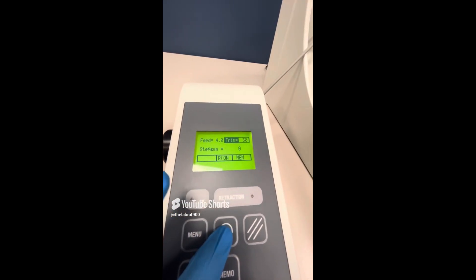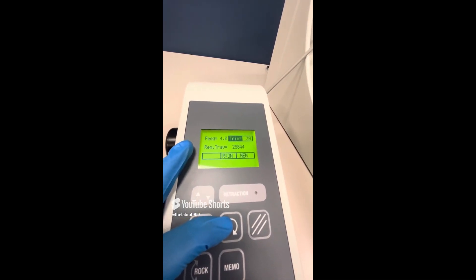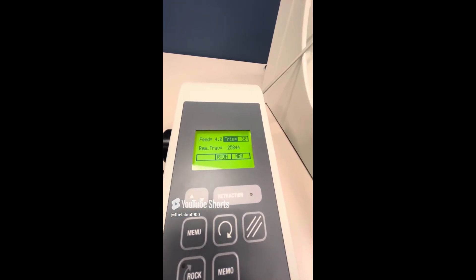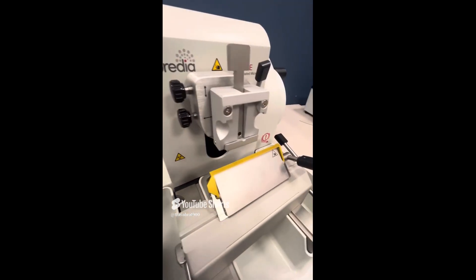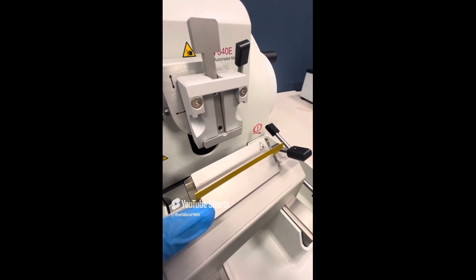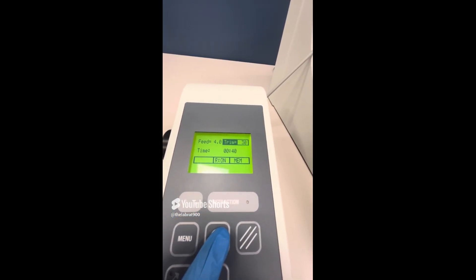Press this button again and you'll see REM trav — that is the remaining travel to the front end position, showing how many microns are left to section before the specimen hits the knife. You don't want to have this device hit there. And there is also the time displayed as well.